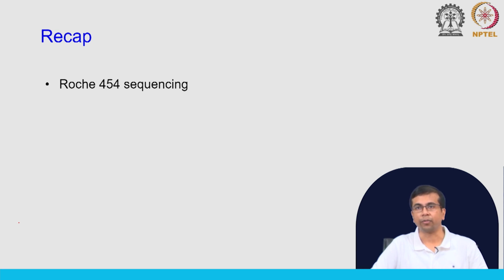Now, one of the first things you probably remember is that we need to amplify the DNA. When you prepare the library, we have to do some amplification. In 454, this is the emulsion PCR, which will generate multiple copies of the same DNA molecule on the bead. The average signal for all the syntheses that are happening on a single bead is detected as a pulse of light. So, the assumption is that all the syntheses across these molecules on a bead are happening simultaneously, and the signal comes together and will be detected.